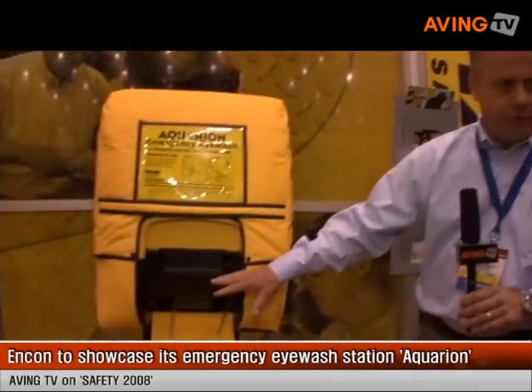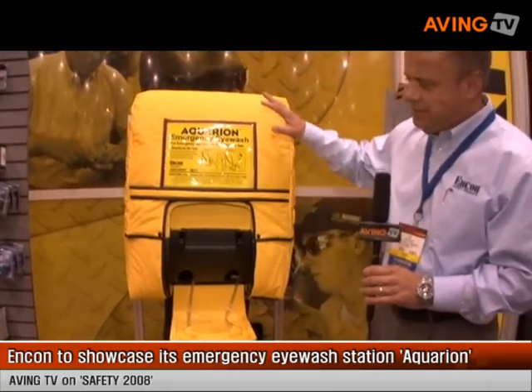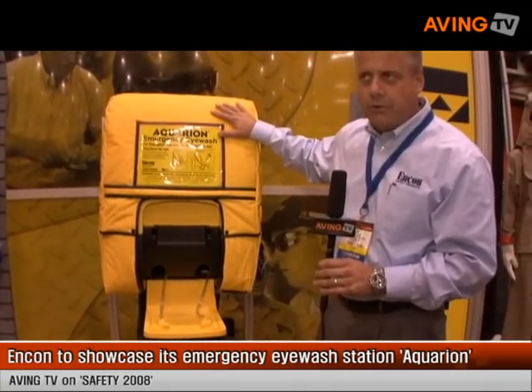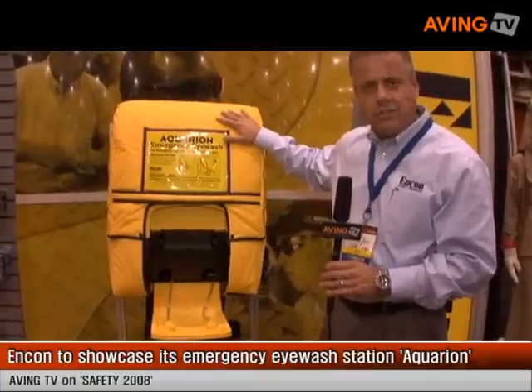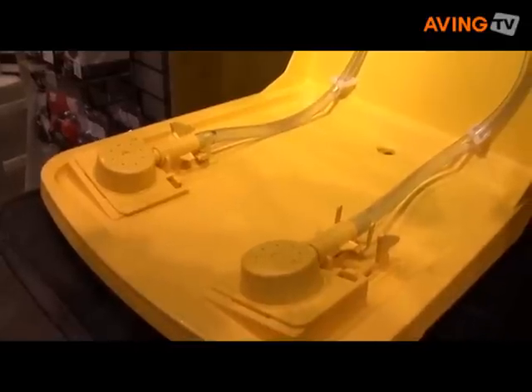One thing about the Heated Aquarian Unit is it offers 15 minutes of full eyewash flush. It has two buffered saline solution bags that offer the full 15-minute flush. They have a two-year shelf life on it, which allows you to not have to refill the unit repeatedly until it's been activated.